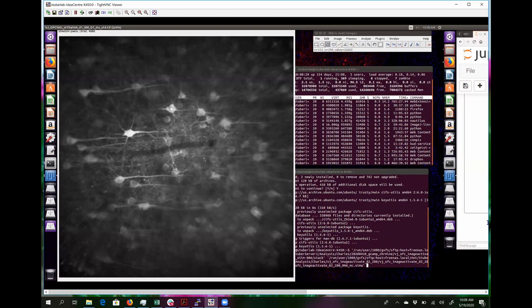Yeah, okay, gotcha. And then is that a blood vessel that's running along where your mouse is pointing? Yeah, so this is a blood vessel right here. Cool. All these dark spots here are blood vessels too. Gotcha. This one's also a blood vessel here. You see it? Yeah, I see that. This one's slightly out of plane, so that's why it's not too sharp.